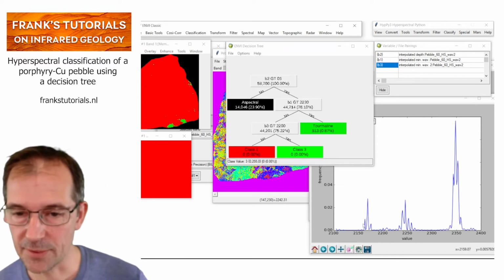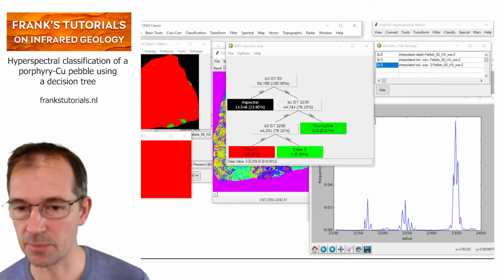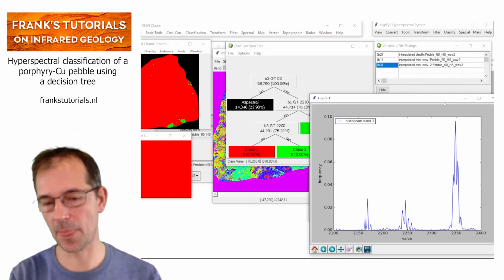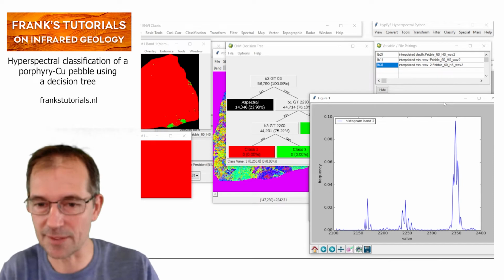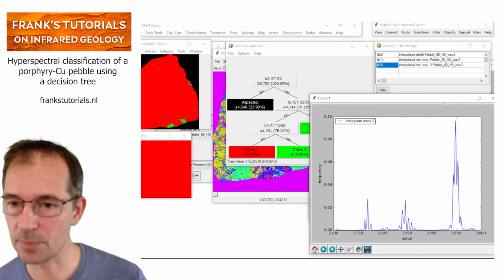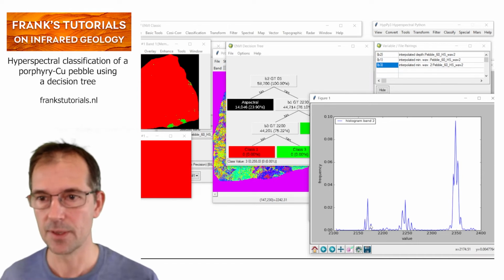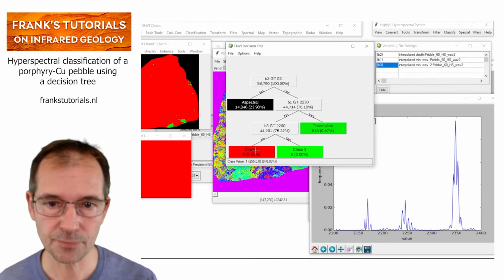One comment: you can see this jagged appearance, that suggests that it's not interpolated. These are just the band. I'm not 100% sure. That's something we have to check, because it looks like the peaks now coincide exactly with the center wavelengths of each of the bands. And if it's interpolated, I would not expect this shape. But it doesn't really matter much for our result.